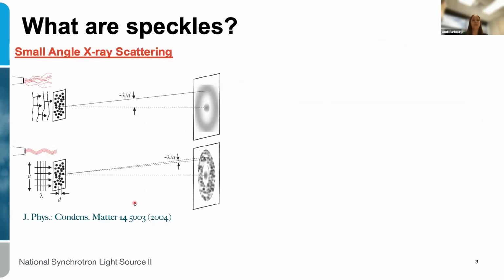I know that many of you don't need an explanation of what an X-ray speckle is, but I know that it's a very broad cross-section of people here today. Basically, we can use coherent X-rays that are monochromatic, that produce a speckle pattern because the X-rays are in phase, much like a laser, as opposed to something like an LED.